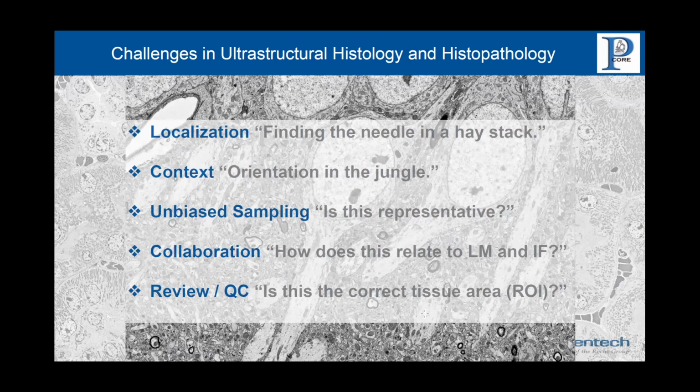Now, because we are located in a research pathology department, most of our questions deal with tissues. And if you ever compare the complexity of a monolayer of cultured cells with the complexity of different tissues, you can very quickly be overwhelmed. So it's important to develop methods that can deal with the particular challenges that we have when we image tissues.